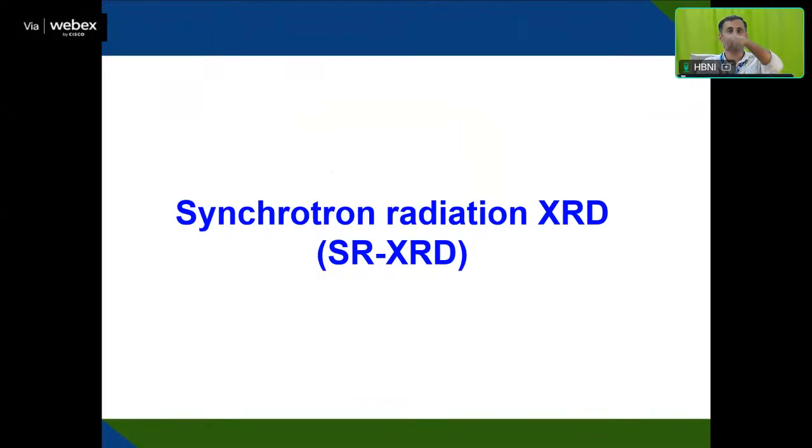From there you get X-ray generation, with copper K alpha or copper K beta or K gamma, whatever you are able to get. But the main drawback in this case is that the detection limit is much above 2%, that is, the doping element should be there at that level, and in terms of intensity or brightness, a conventional X-ray source is not that strong.